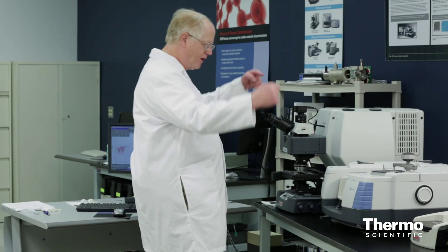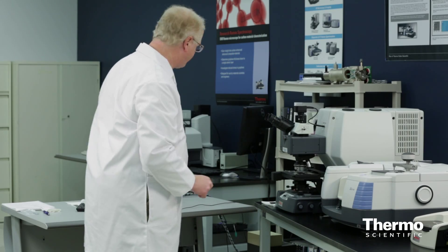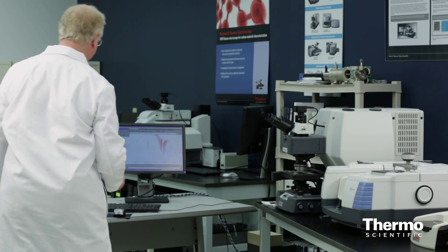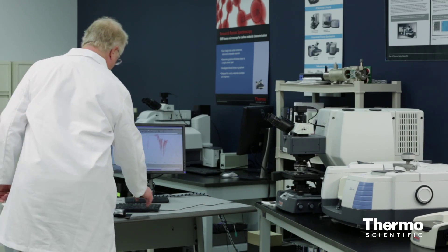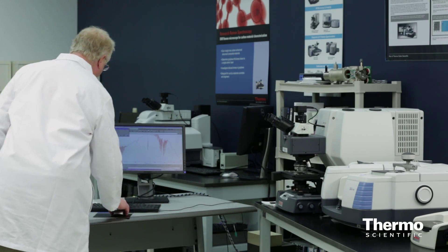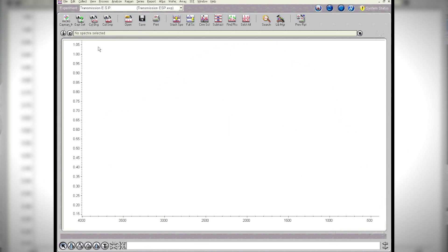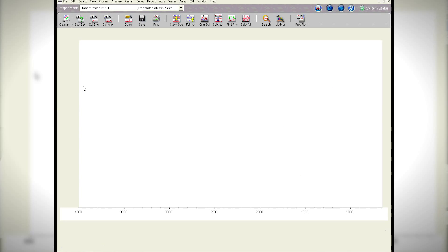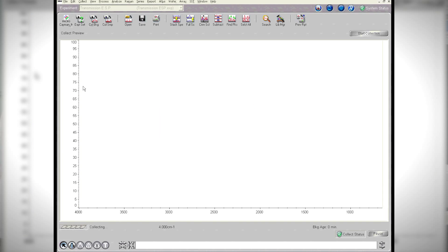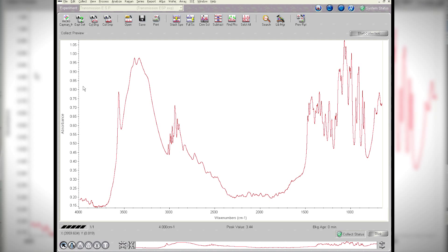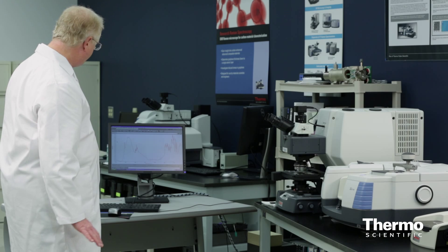The IR beam is now directed down onto our sample in the potassium bromide powder. I don't need to save the background — it's stored — so now we'll run the sample and you can see the spectrum.